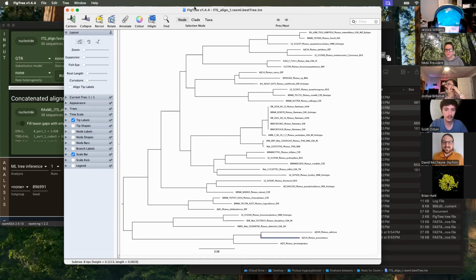And we can see all of our various clades that should more or less correspond to Husto's Pluteus clades. So we've got the Detrichii clade. Here we have... So actually, I didn't tell it to root it. So here's the thing, actually. I could have told it to root it with the outgroup because this is section Pluteus here. So this actually is functioning as a root. I didn't tell the software to use it as a root. You don't have to tell the software to use it as a root.